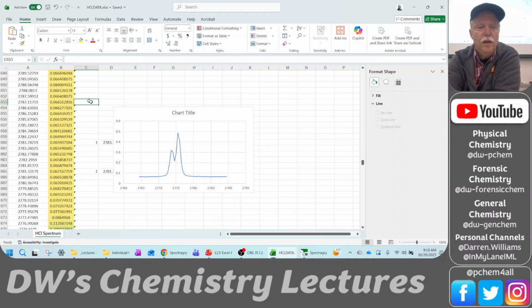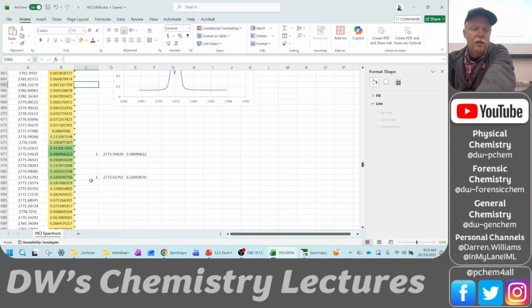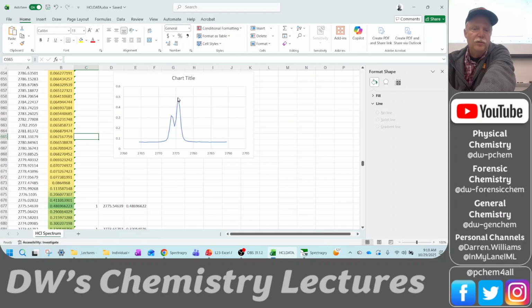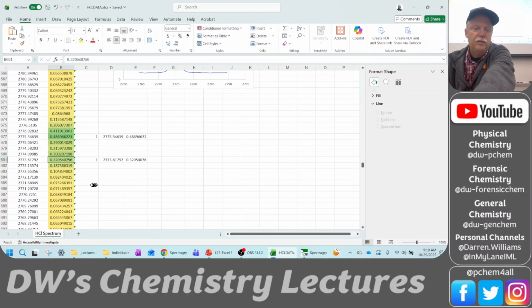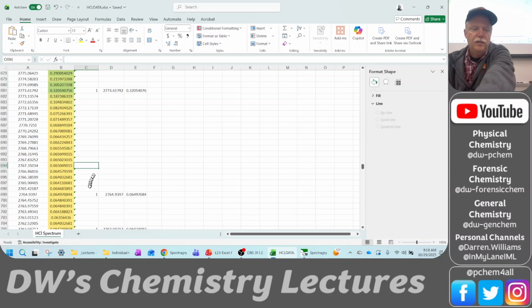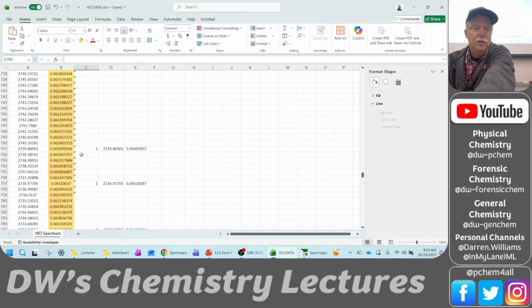You would take those 2 peaks though? Yeah, I would take those 2 peaks, but I would delete these guys. These are coming in as noise. And these I would keep. These right here are the, see, almost 0.5. Here's 0.48. So that's the big one. Here's the 0.32, 0.32. So these are those 2 peaks right there. And so these are noise, these are noise, these are noise. Okay, and here we've got 2 more good ones. So I'm keeping those. These are noise, these are noise.